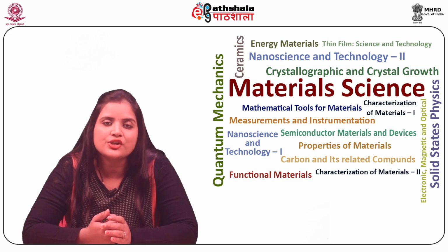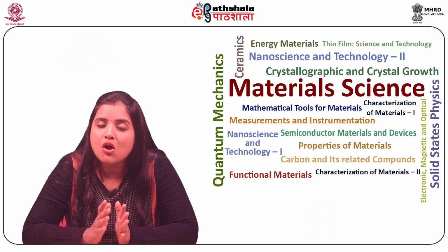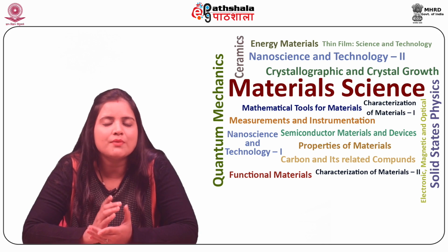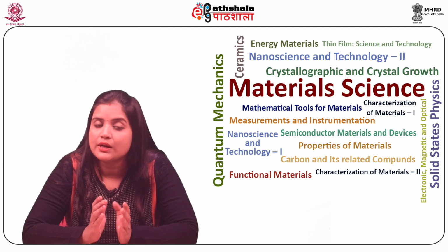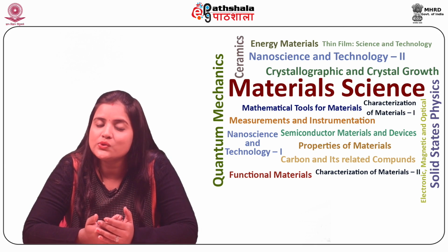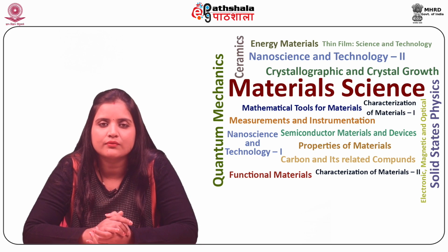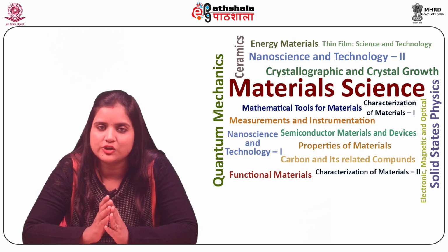The second application is surface 3D topography. Analogous to other 3D optical profilometers, DHM performs static measurements of three-dimensional surface topography. It has been applied to a wide range of samples including medical implants, watch components, micro-optics, etc. Third is the time-resolved applications.